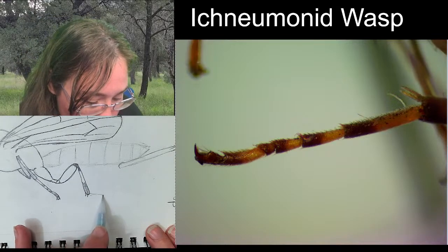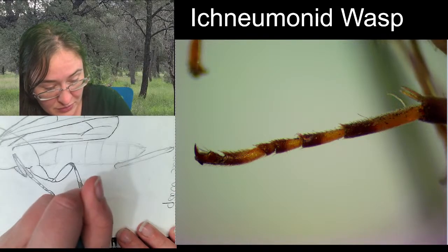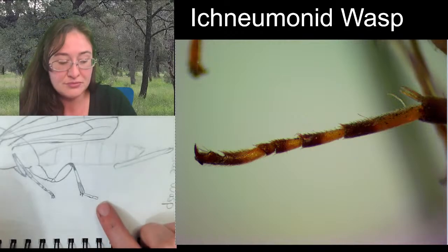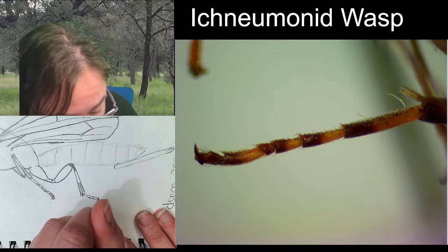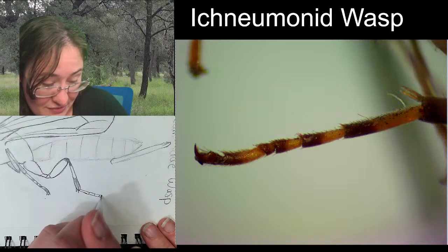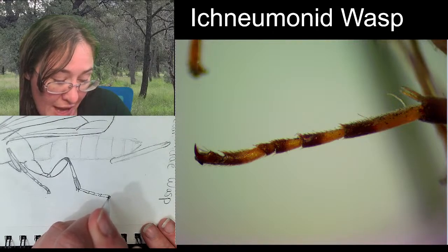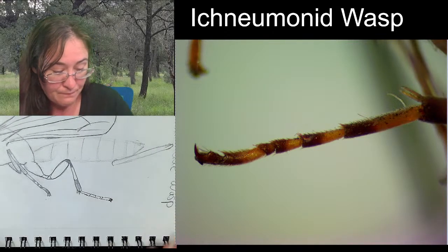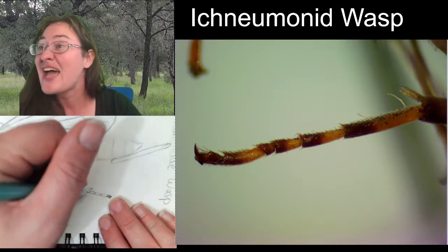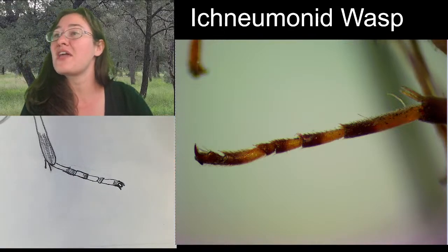So, let's see. 1. Claws and the toe pad, or the pulvilli. And then at the end of each one of these tarsal segments, it is darkened. And that fourth one is all the way darkened. Something like that.